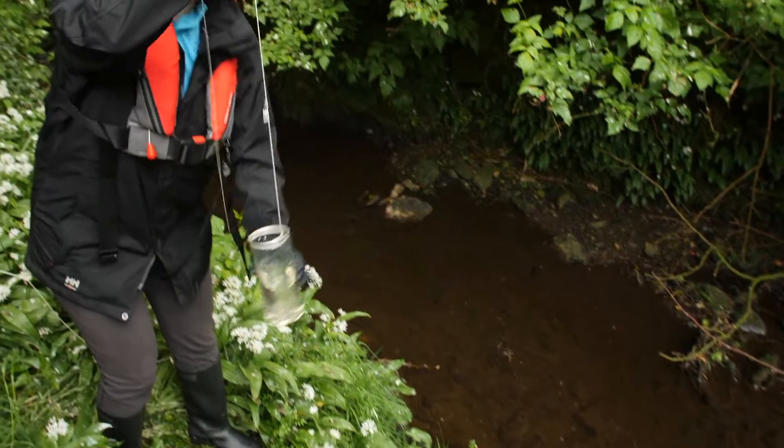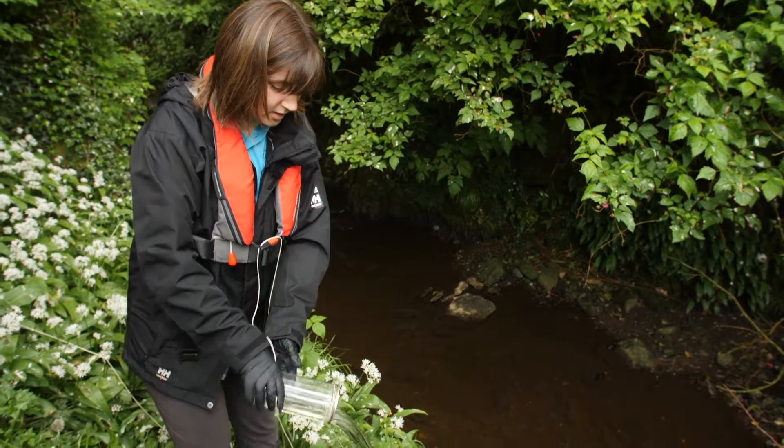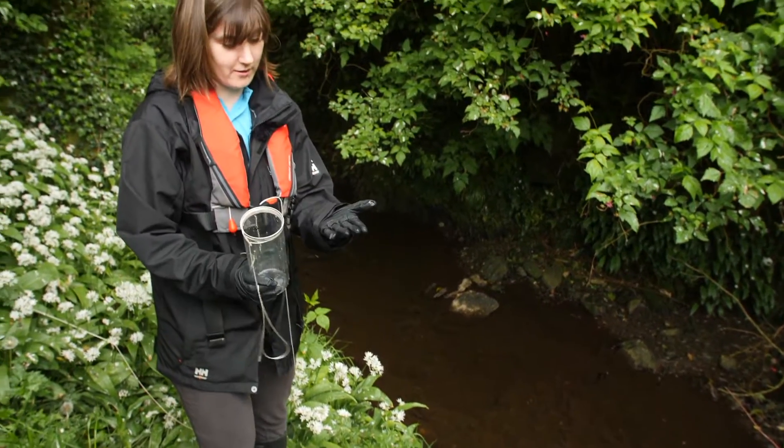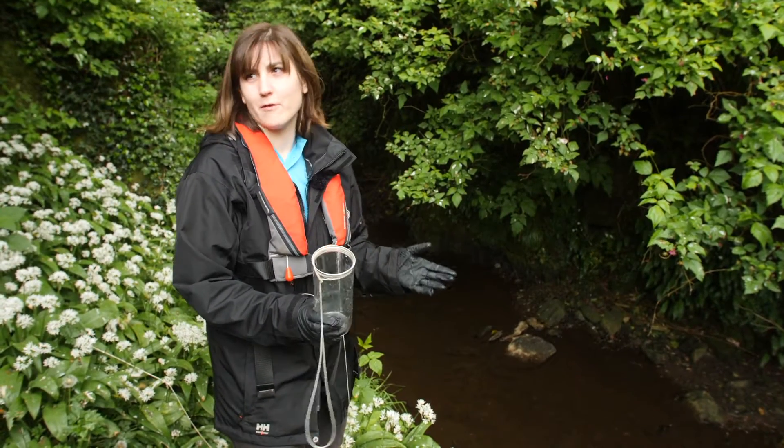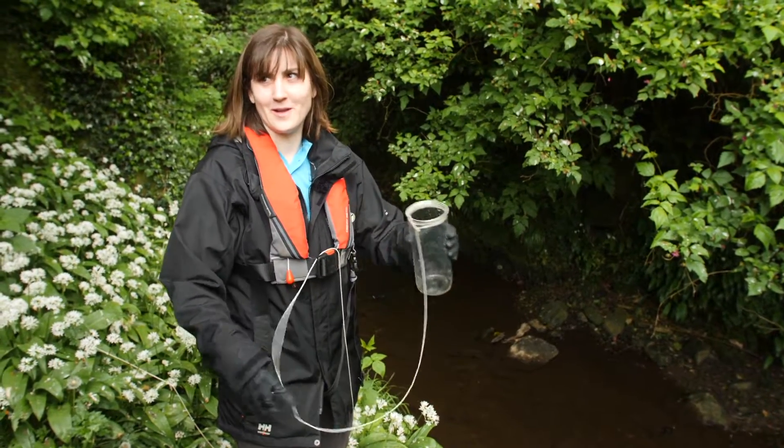So you don't go into the water to get the sample? No, and as you can see I'm wearing gloves, because with a sewage discharge there could be bacteria or viruses, so you have to think about your own health.